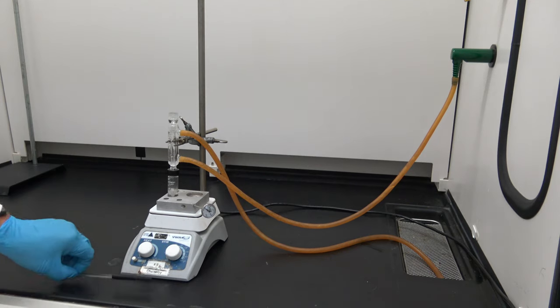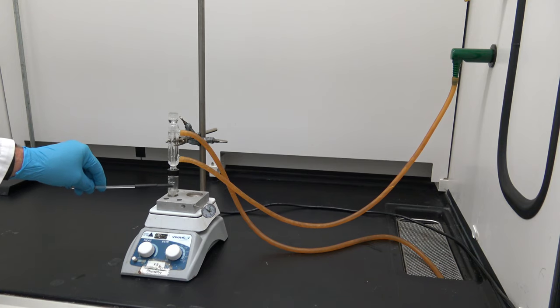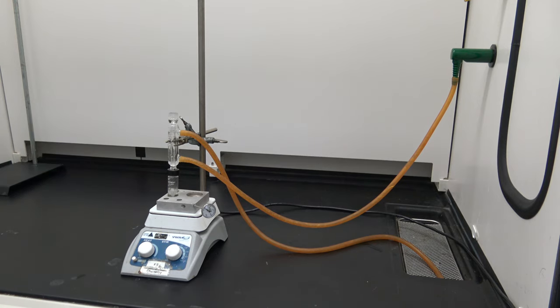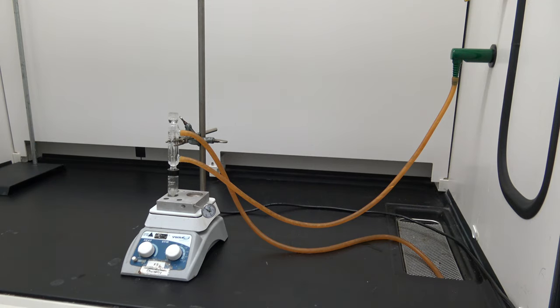The idea behind this system is that I heat up this vessel to a point where it's boiling. As my liquid turns into a vapor, it starts to move up the column, it hits the cold water, and then condenses back down into my reaction vessel. This has two purposes. One is to maintain a constant volume of my solvent, the liquid in my reaction vessel, and also to maintain a constant temperature, because my solvent, which is going to be aqueous in this case, will boil at about 100 degrees Celsius and stay there.